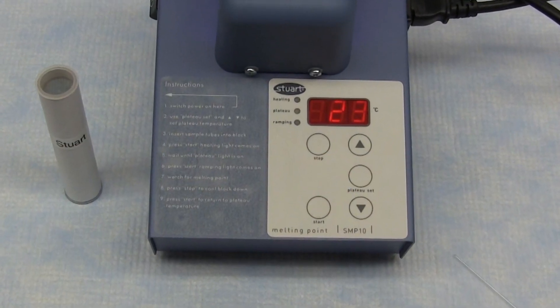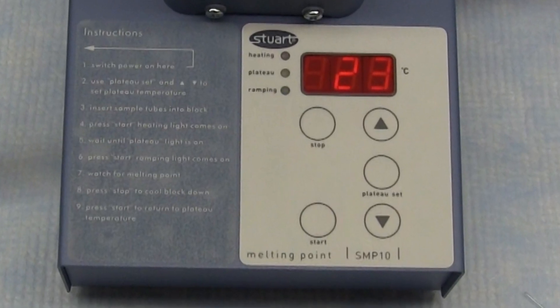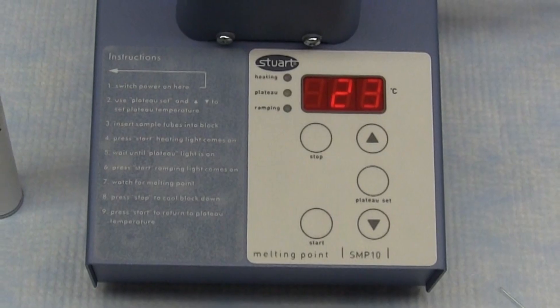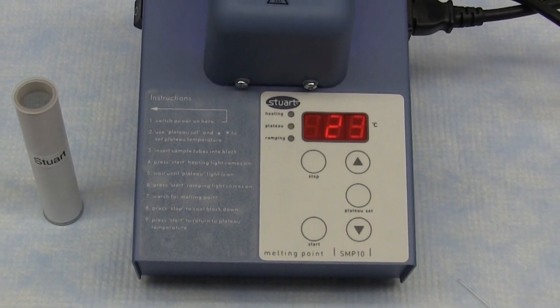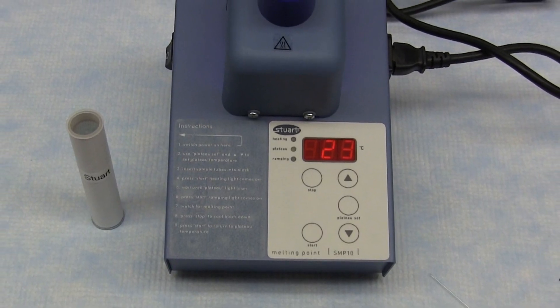In order to avoid the necessity to continually watch the sample, the SMP10 is equipped with a plateau function. This allows a temperature to be set a few degrees below the expected melting point, and the machine will then heat to this temperature very rapidly at about 20 degrees per minute and hold it until the operator is ready to begin measuring. When measuring is started, the apparatus will heat slowly at 2 degrees per minute from the plateau temperature until melting occurs, and this slow rate of heating allows accurate melting points to be obtained.